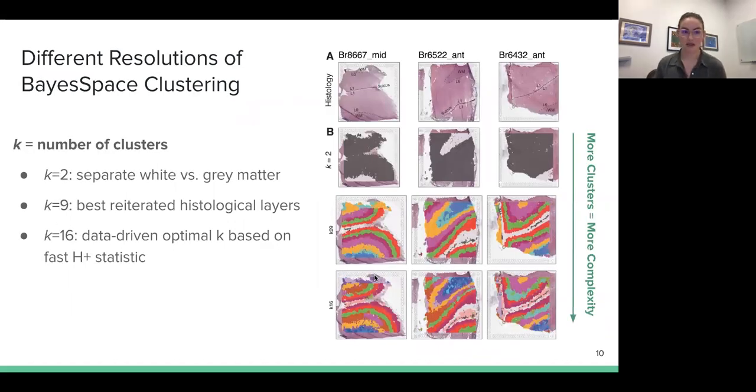In the Visium data using BayesSpace, we examined the clustering of the spots at many different resolutions, where K here is the number of clusters that we asked BayesSpace to produce. So first we took a look at K equals 2, and we found that that accurately separated white versus gray matter in the tissue. Next, we found that K equals 9 best iterated the histological layers in the tissue. And K of 16 was a data-driven optimal K based on the FAST-H plus statistic. So basically, we studied this tissue with increasing clusters and more complexity.